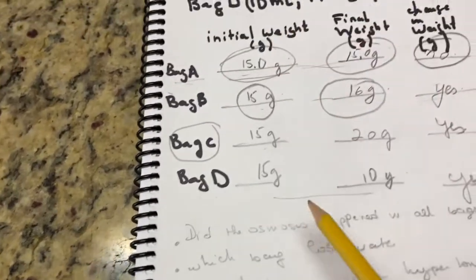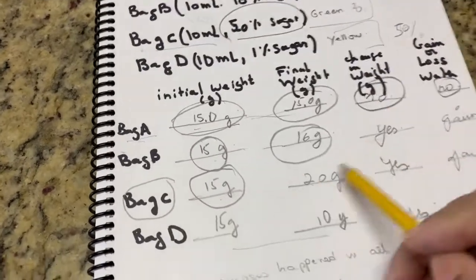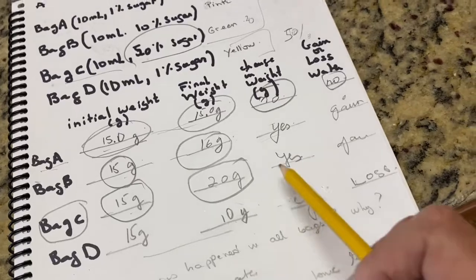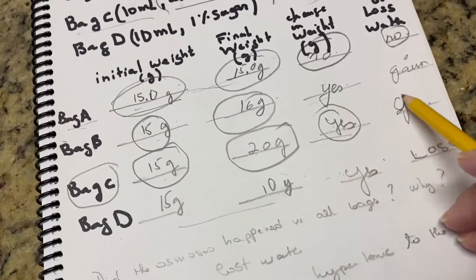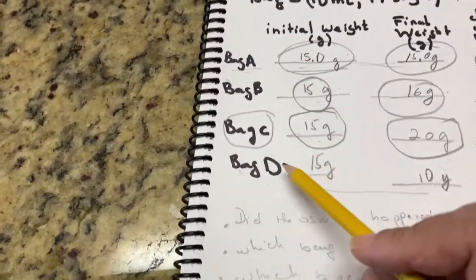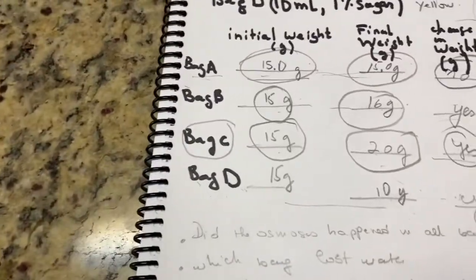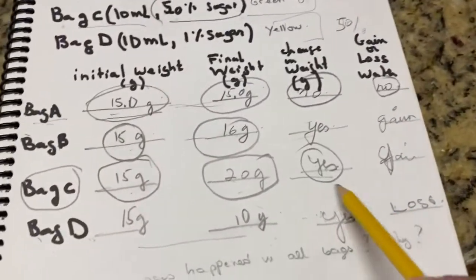Bag C has 50% of sugar, right? It weighed initially also 15 grams. After 30 minutes in a container that contained 1%, it also gained a lot of weight, almost 5 grams. So it changed weight, yes. Bag D, however, contained 1% of sugar, but I put it in a container that contained 50% of sugar. It lost dramatically. If you look at it, it looks fluffy, it lost water.